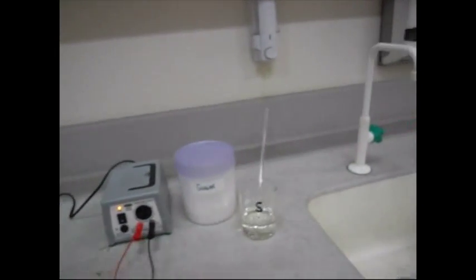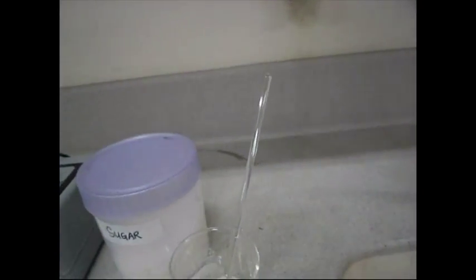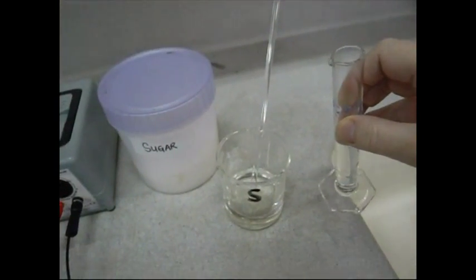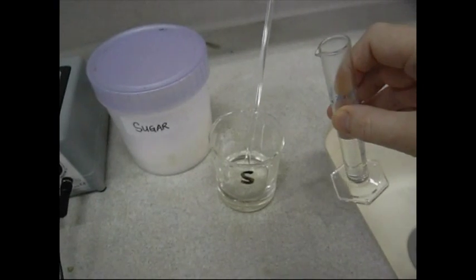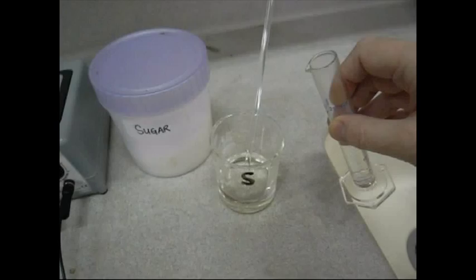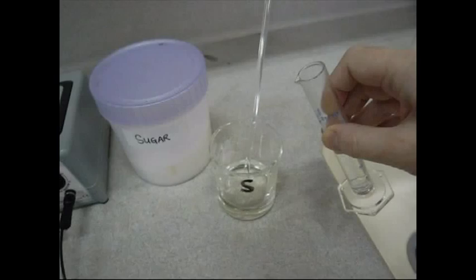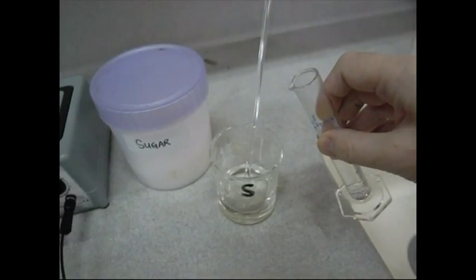This experiment involves mixing 20 centimeters cubed of concentrated hydrochloric acid with a solution of sucrose made up from 50 grams of sucrose dissolved in 50 centimeters cubed of water. As soon as the acid is added to the sucrose solution, hydrolysis of the sucrose starts, producing the products glucose plus fructose in equimolar amounts.